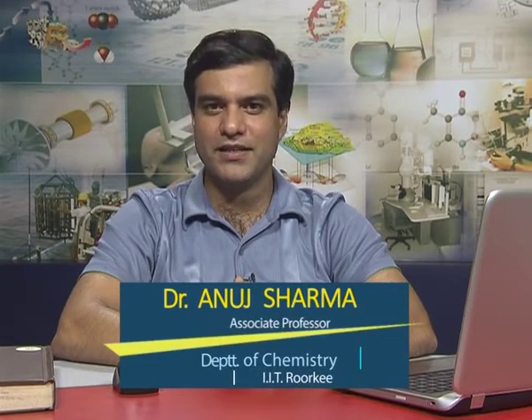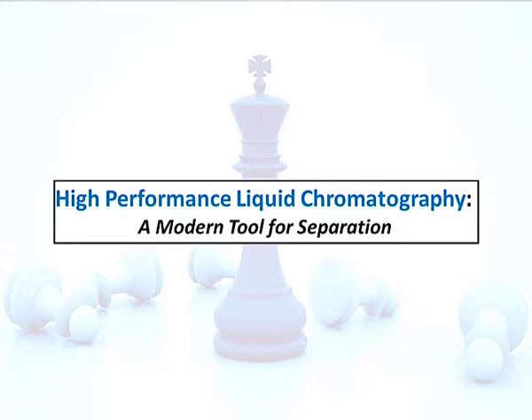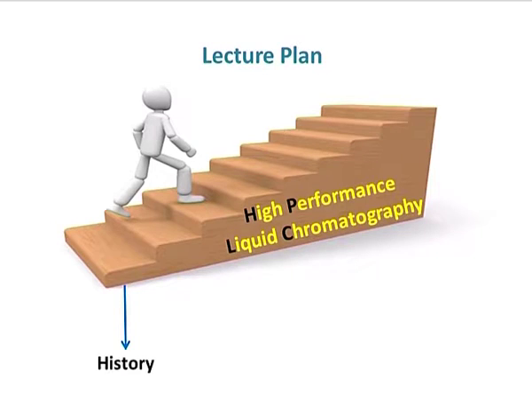Hello and welcome to this last lecture on purification and separation methodologies. In today's lecture, we are going to study high performance liquid chromatography, which is an advanced form of chromatographic separation method. In this lecture, we are going to discuss the history of HPLC, which is high performance liquid chromatography.